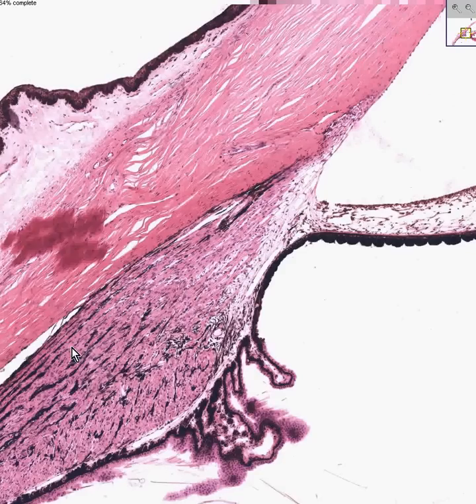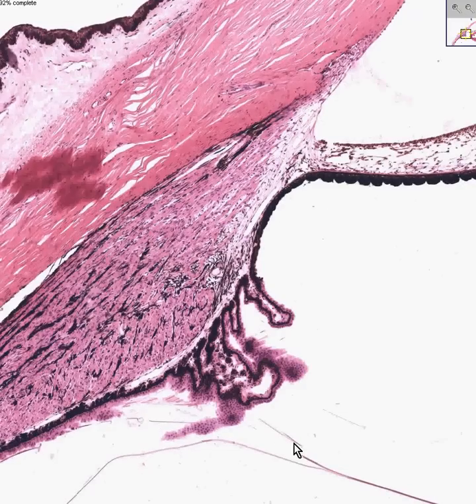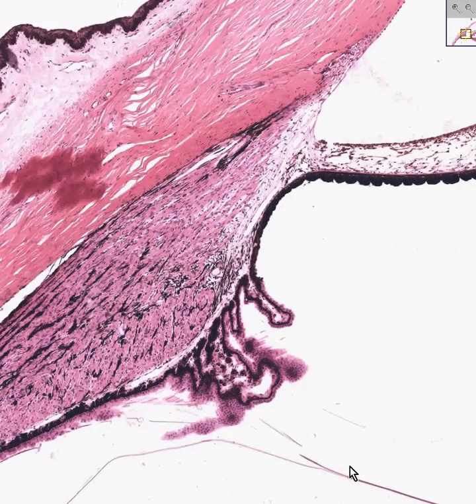This is the ciliary body. These are ciliary processes. They contain these small little zonular fibers, which are like tiny tendons, that help flatten the lens and they pull by virtue of the smooth muscle fibers in the ciliary body.